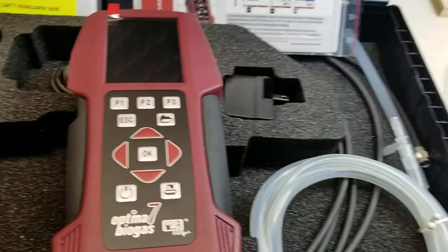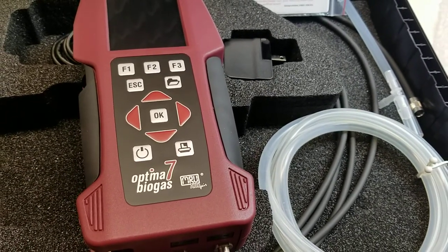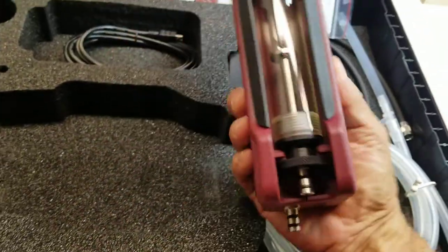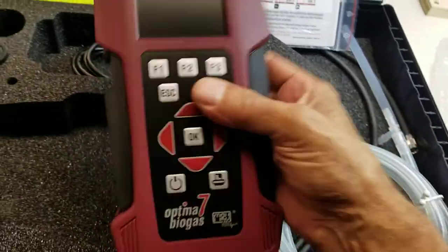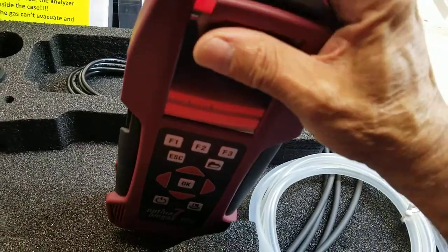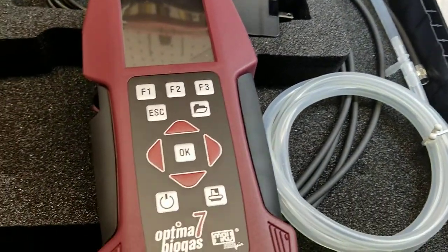It has Bluetooth built in so you can synchronize with your smartphone or smart device, and an optimized backlit condensate separator — you can see that here, really a nice feature with these instruments. And an SD card reader right up here on the top — very nice. Internal storage for up to 16,000 measurements.